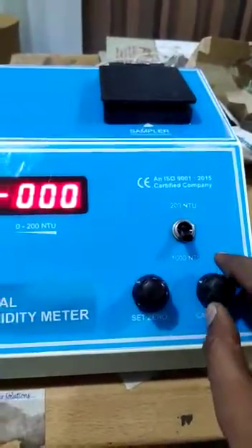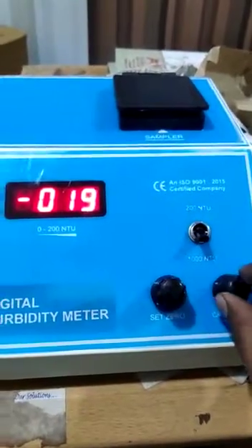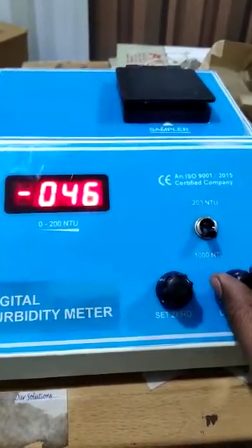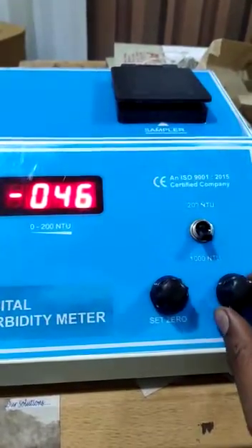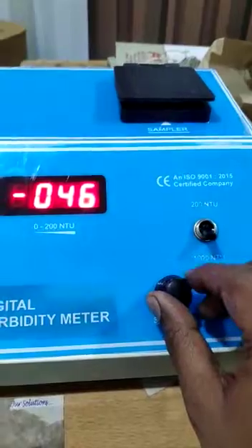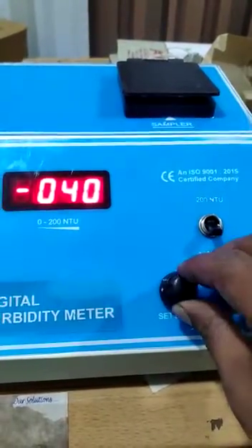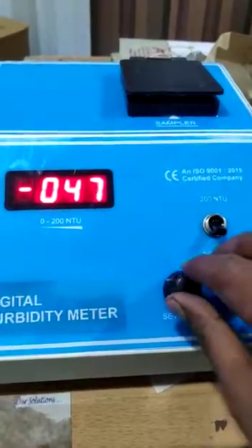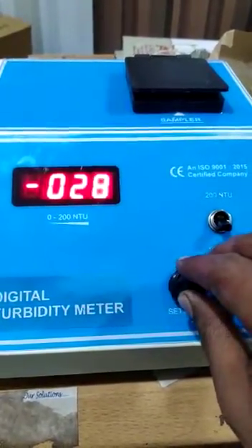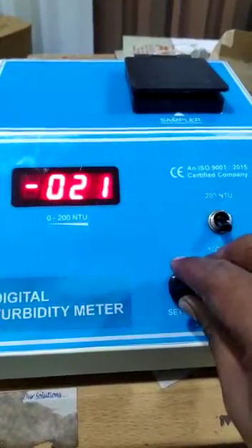Now turn the calibrate switch completely to the right side. Now, moving this one — the set zero button — make the machine zero zero zero. This way is decreasing and this way is increasing.